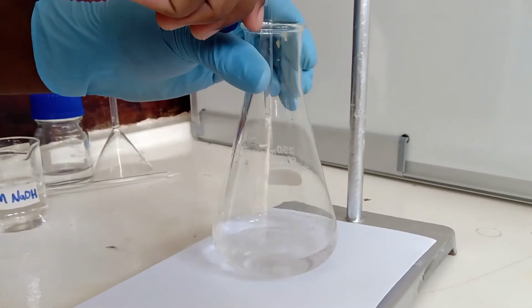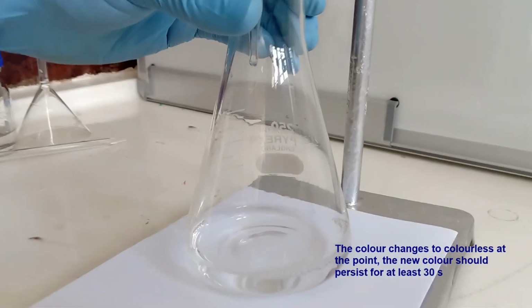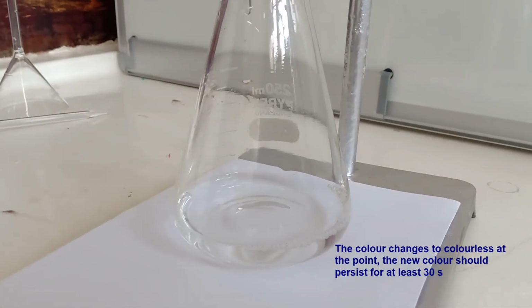Your hand should be on the tap and the eyes on the flask all the time, and close the burette immediately when you observe a color change. Record the final burette reading.